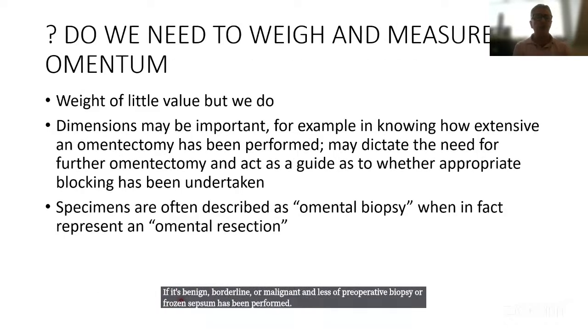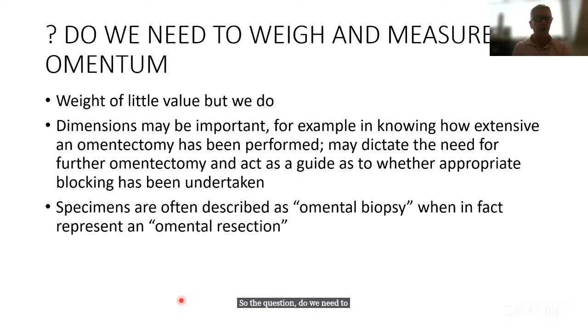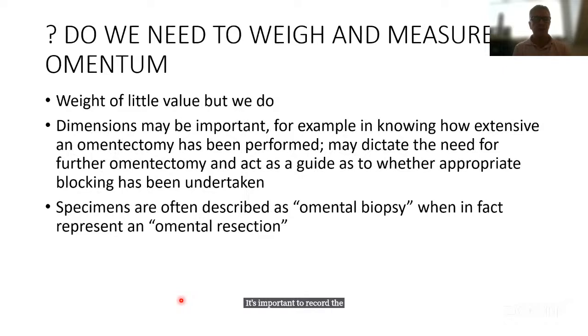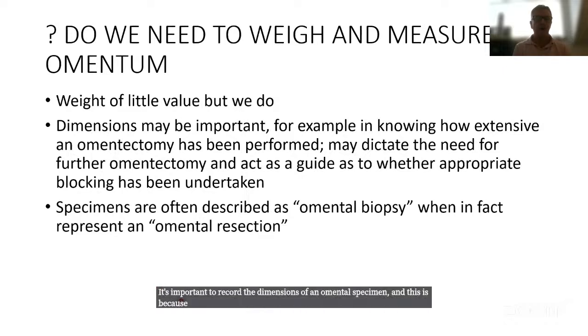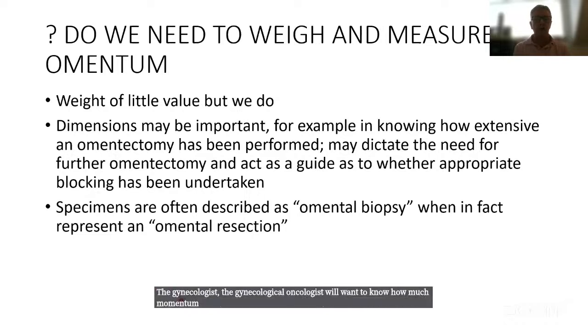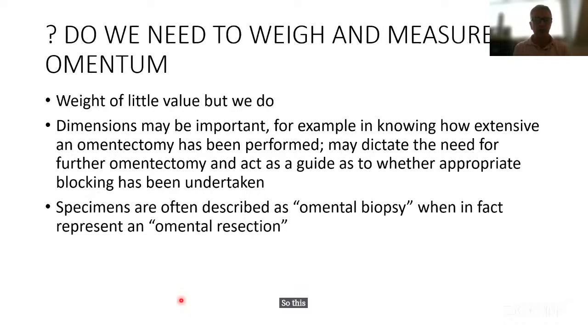So the question: do we need to weigh or measure the omentum? Well, the weight is of little value, but of course we tend to weigh these things. It's important to record the dimensions of an omental specimen, and this is because if a part of the omentum is being removed and the lesion within the ovary turns out to be malignant, the gynecological oncologist will want to know how much omentum has been removed. So this is really why we need to measure any omentum which has been removed.